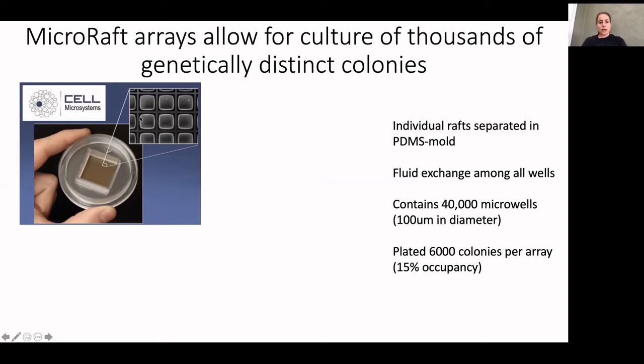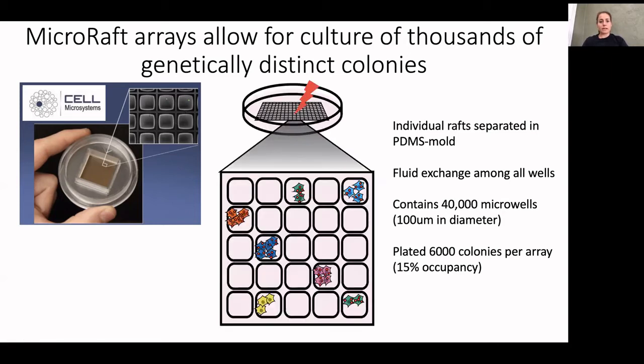We chose this size because it was good enough for us to be able to grow a robust colony of 293 T cells to be able to screen for. And we wanted to increase throughput. So we wanted to be able to analyze as many different wells as we could. And so the way that you plate cells in here is using math of limiting dilution and just plating. We ended up plating about 1/3 of the number of cells that could, so 40,000 divided by 3.